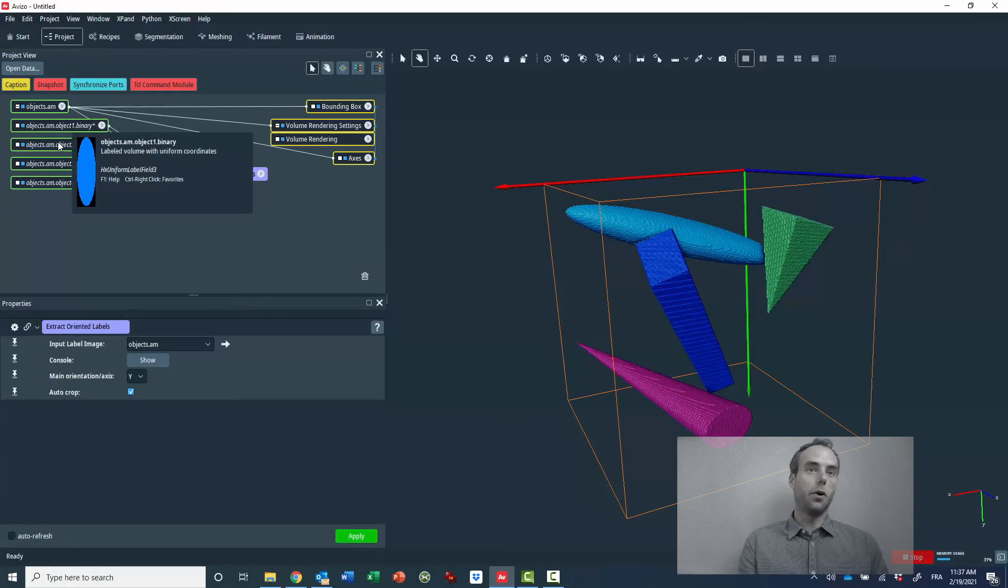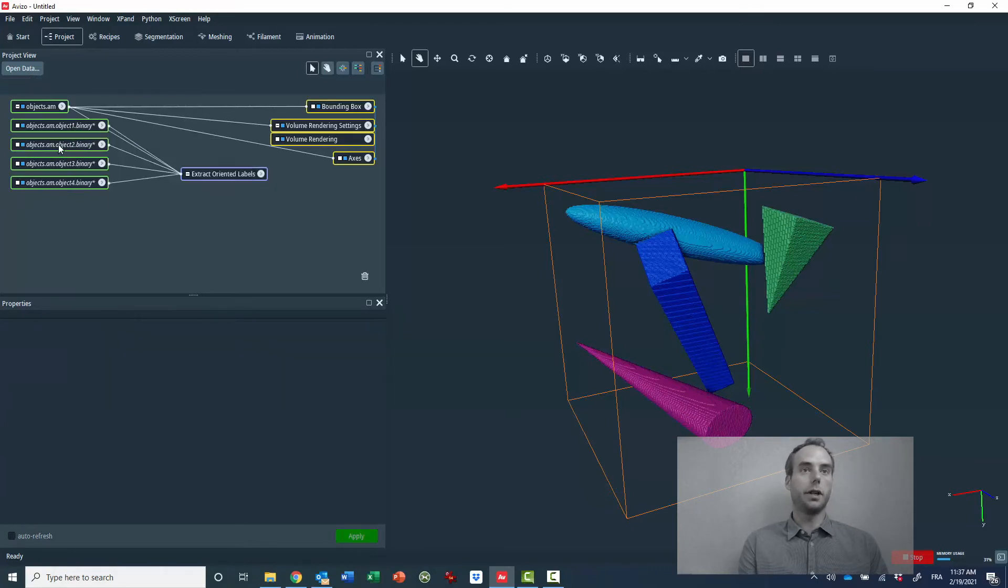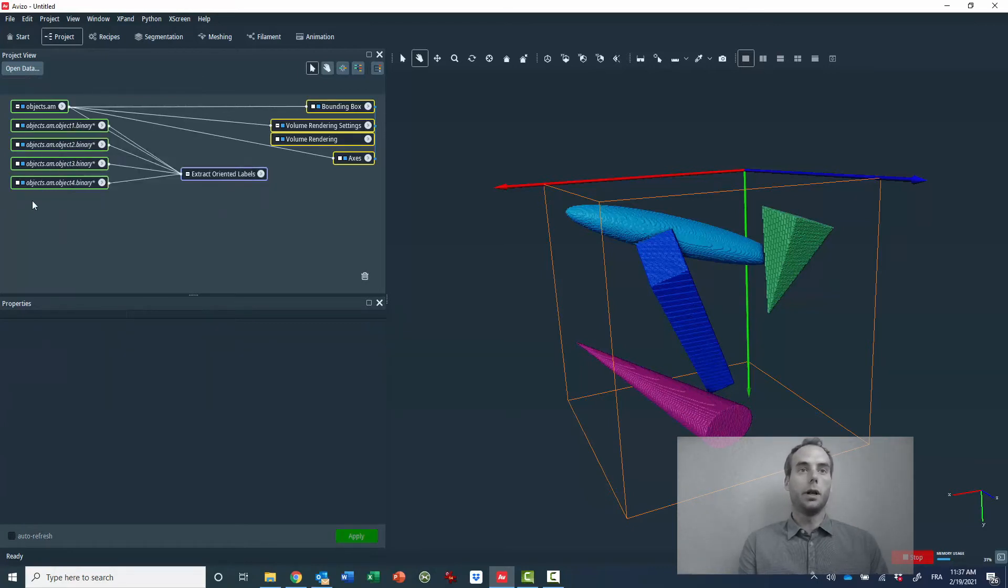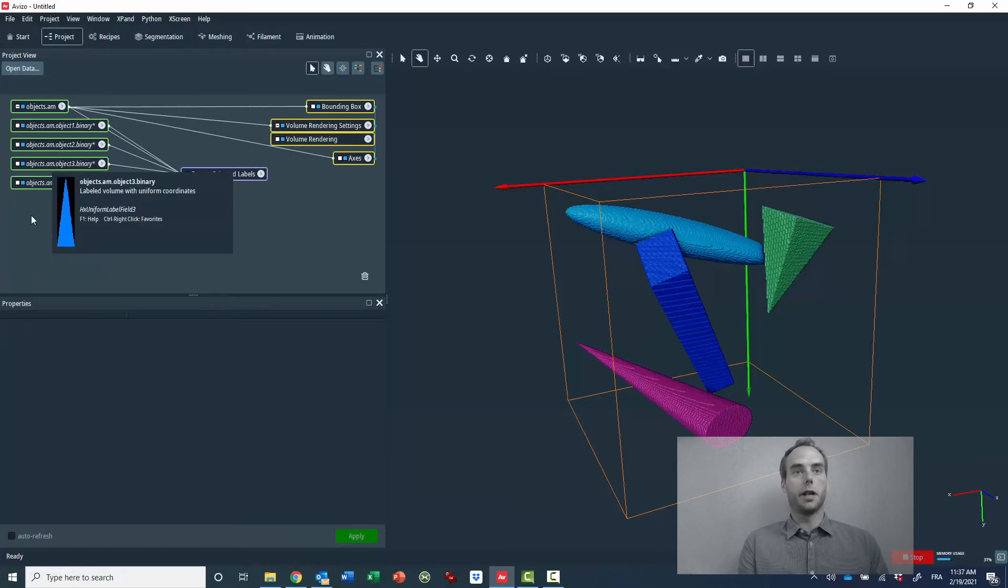So you can see the four results of the module and you can recognize on the preview the very typical geometrical shape.